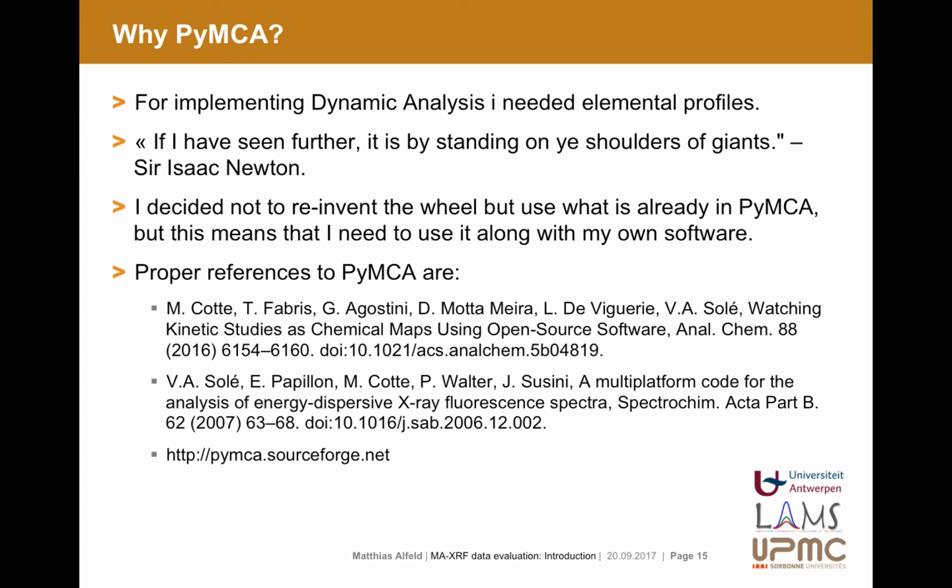However, I have not seen further. If I have seen further, it is by standing on the shoulders of giants, as Isaac Newton said. Or better, no one is going to congratulate you for reinventing the wheel. So I went to PyMCA, which means that I always need to use it along with my own software. I need to explain it along with my own software so that people understand how to use it. However, I'm not the developer of PyMCA, and the developer of PyMCA has his publications there, which should be cited if you use Data Muncher with it, and they also have their SourceForge page.